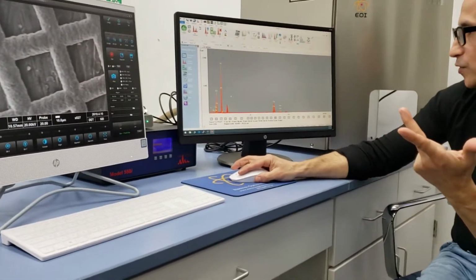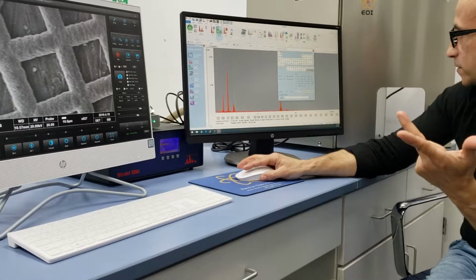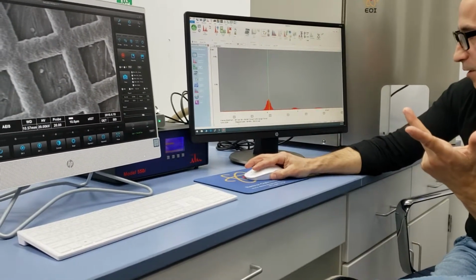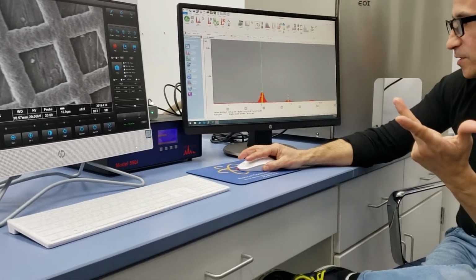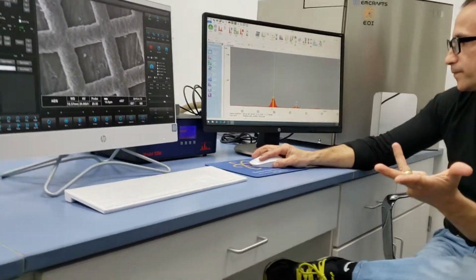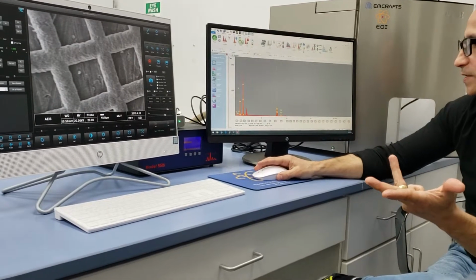Fourth way is you grab your cursor, you spread it, you put the peak in, and it tells you where the peak is sitting, 8.055 possible ID, double click that. Fourth way, double click the cursor. Fifth way, I don't know what the hell is there, you tell me, auto ID that sucker for me.